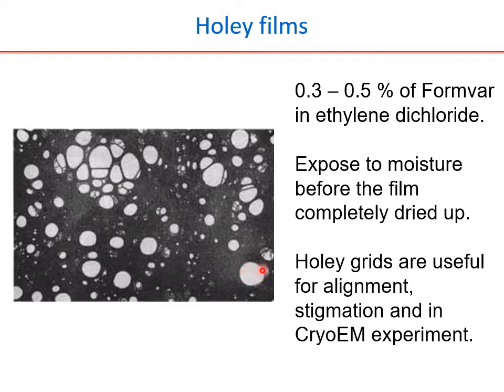Because it looks like a well, just imagine if you spread water, the water will stagnate in this place and accumulate in the well. Our protein in a buffer looks like water. There will be some protein stuck onto the carbon surface and some protein trapped in the well.